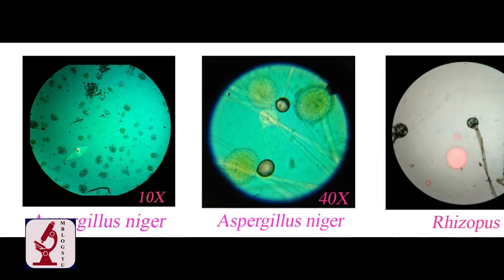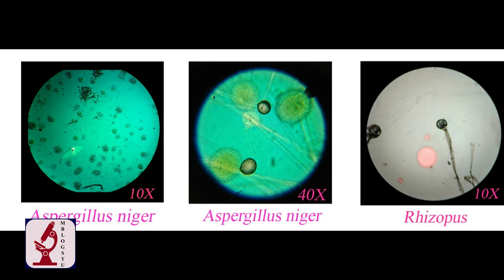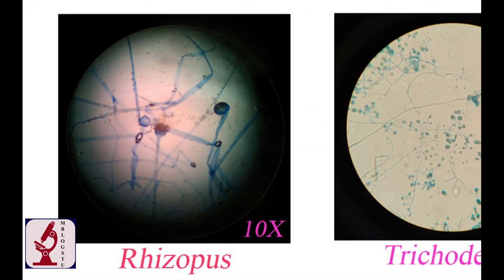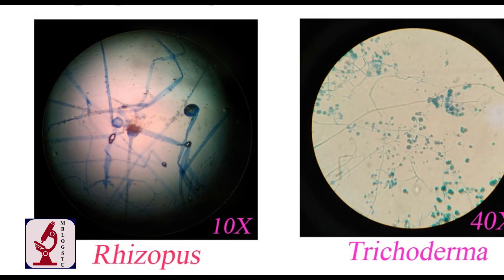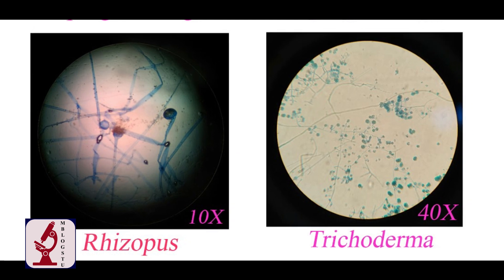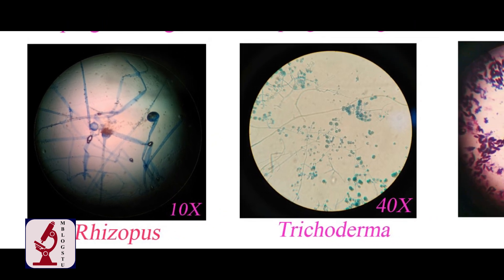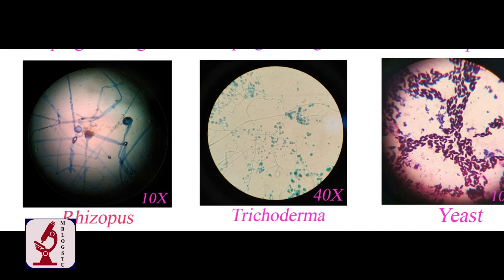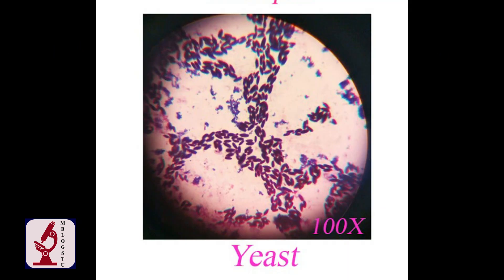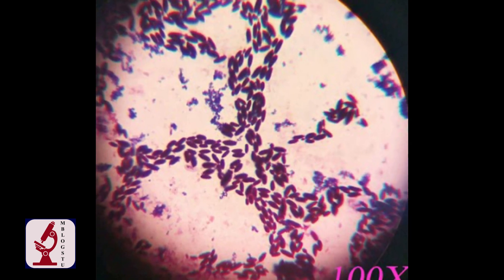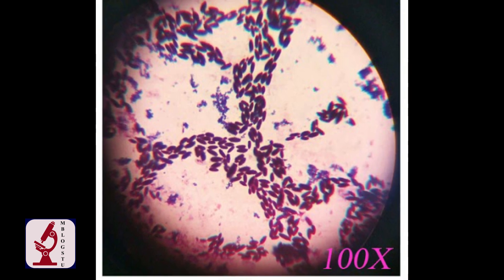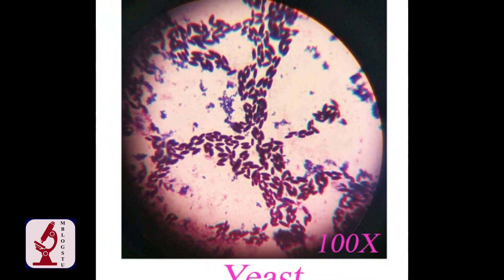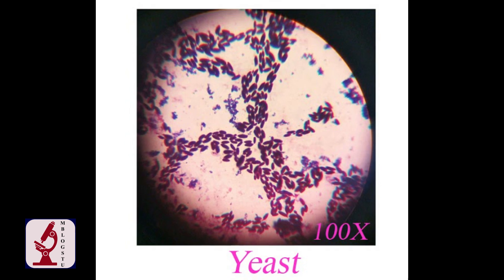Number 4: Rhizopus. Number 5: Trichoderma. This is the gram staining of yeast at 100x in oil immersion — they are gram positive. You can see the purple staining yeast.